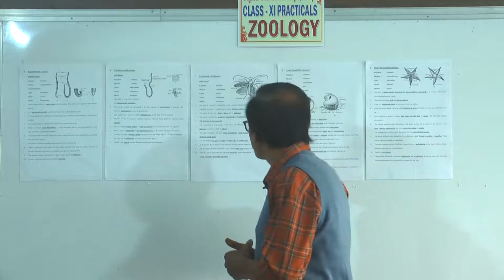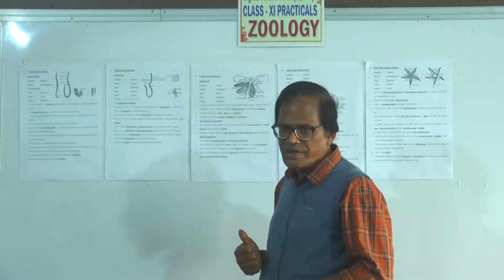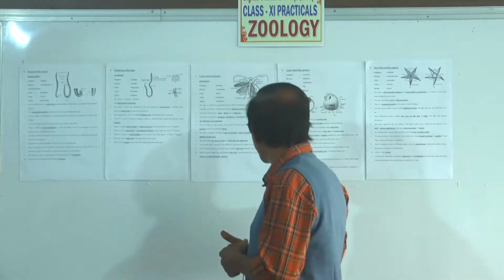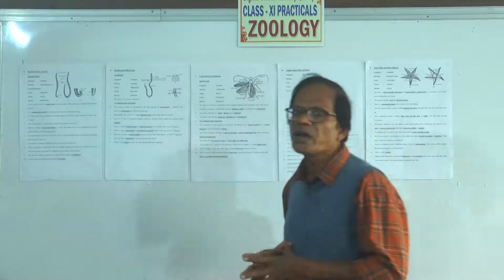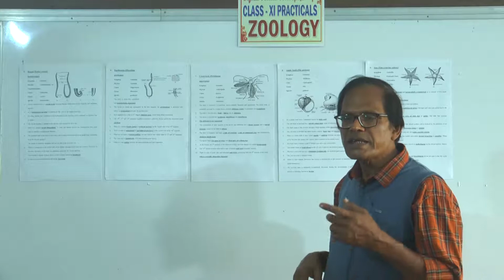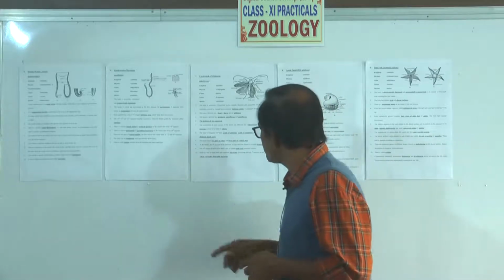This seventh sternum is largest among all the sterna and is boat shaped, especially in the female cockroach. This boat shaped seventh sternum is referred to as a hypogynium. It's not present in male, only in female. So the presence of the hypogynium is a sexually dimorphic character in cockroach.